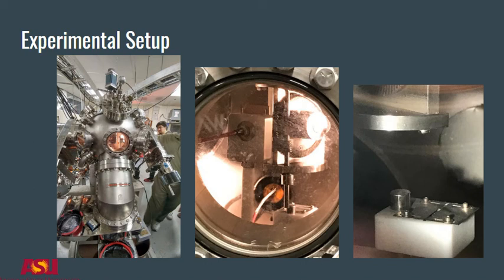From left to right, you can see the entirety of the RBS, the inside of the chamber, and the sample holder necessary for this experiment.